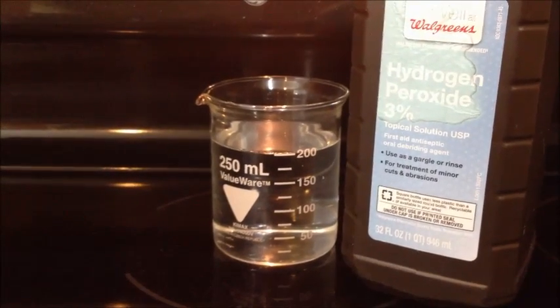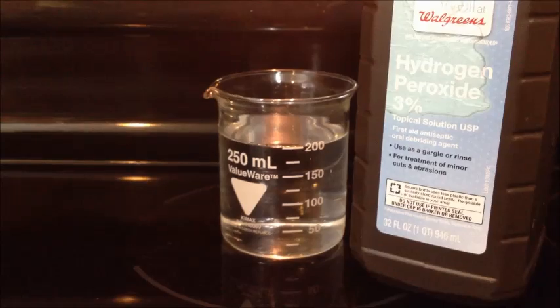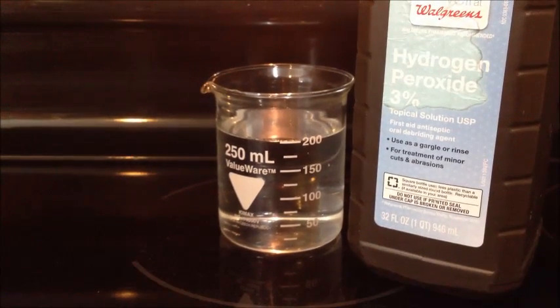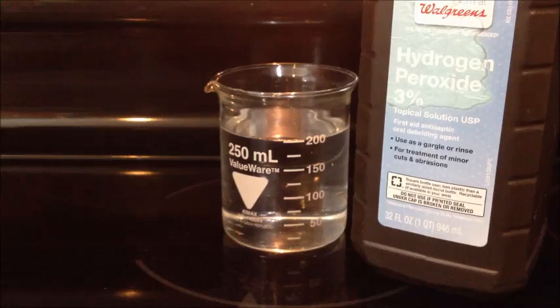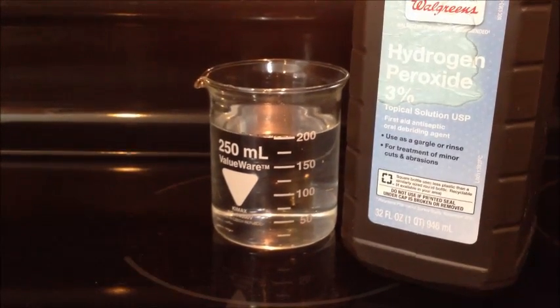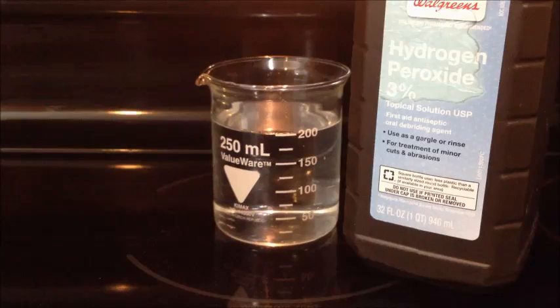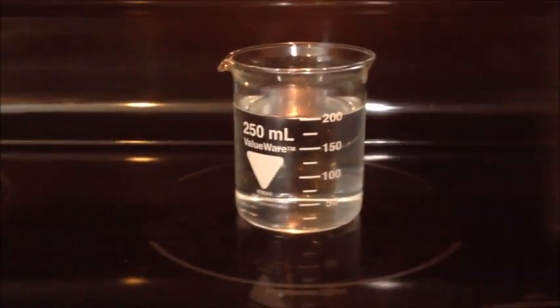Start by cleaning out your beaker really well — you want to make sure it's as dust-free as possible. The more dust or anything you have in there, the faster the decomposition of the hydrogen peroxide will be, and that will result in a less potent product. So without further ado, let's start getting this going.